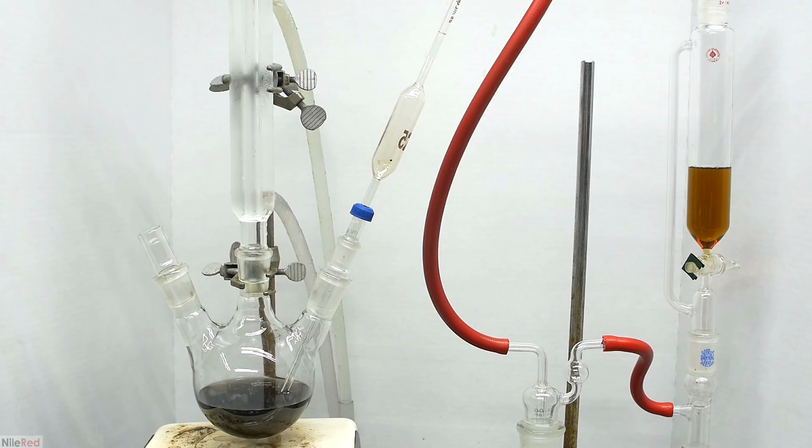In the addition funnel above, I've placed a small amount of 93% sulfuric acid drain cleaner. The reason that I use sulfuric acid here and not something like hydrochloric acid is simply because the water content is very low. If we use something like hydrochloric acid, we would generate more water vapor, the calcium chloride would have to absorb more, and maybe some would get into the reaction.